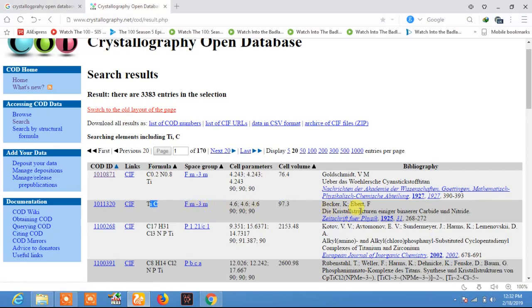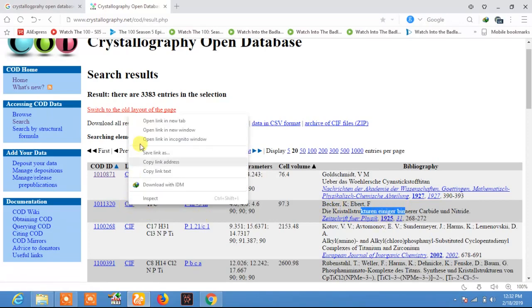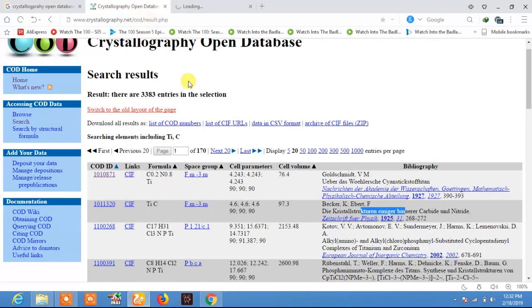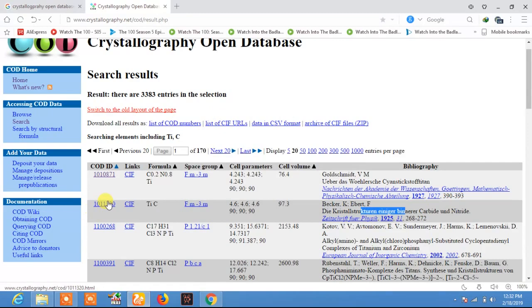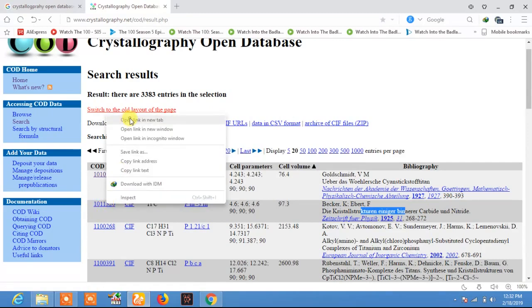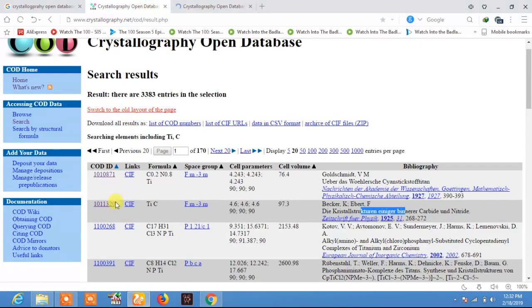Click on the CIF to download it. If you want to visualize it directly here, just click on this. This is the COD ID of titanium carbide.